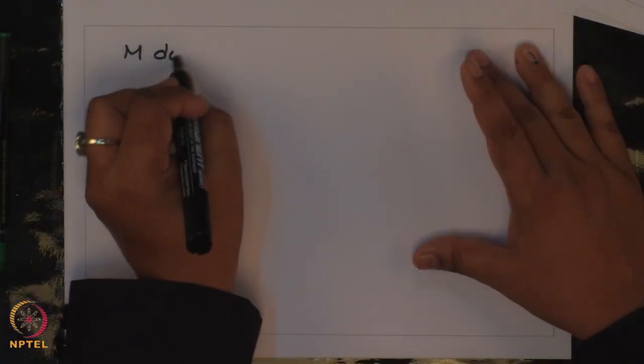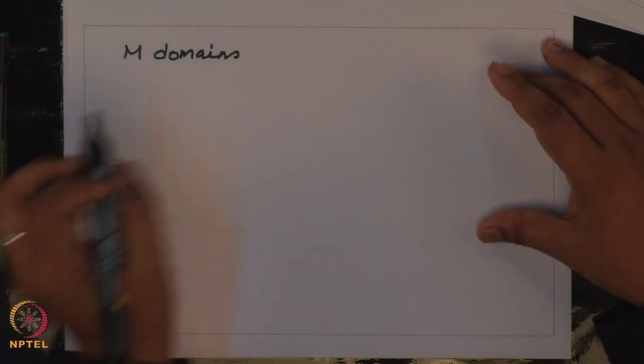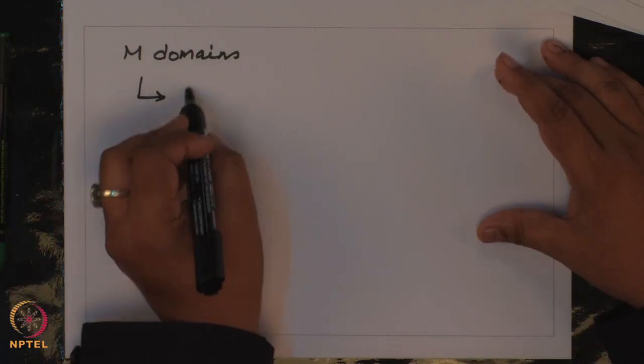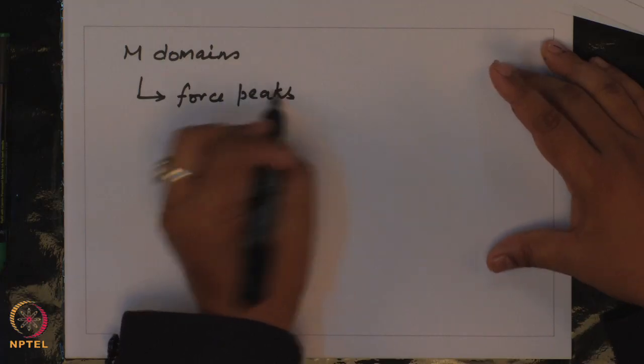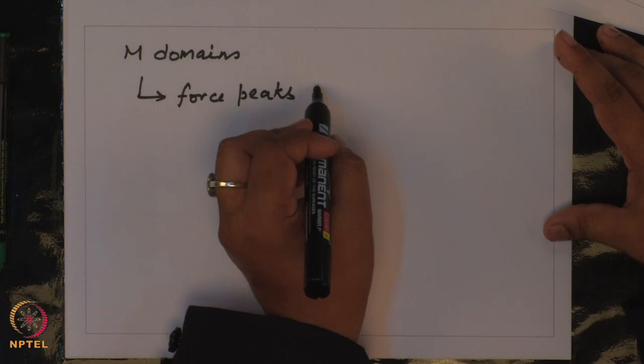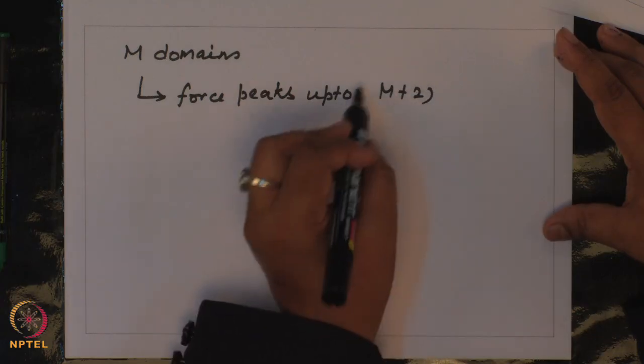Now, fine, you got your peaks. The first thing is to record the data, but now it comes to analyzing the data. Let us say you have a protein with M domains, and you get force peaks up to M plus 2.